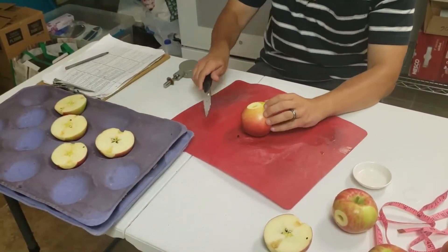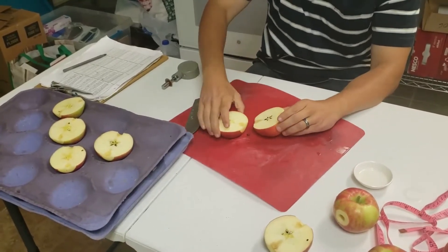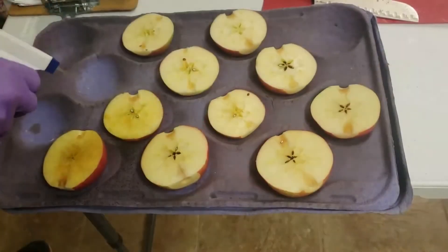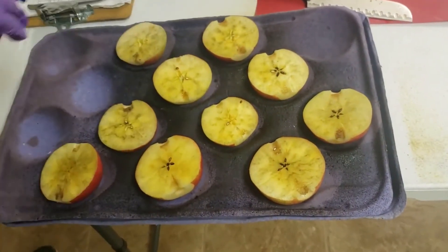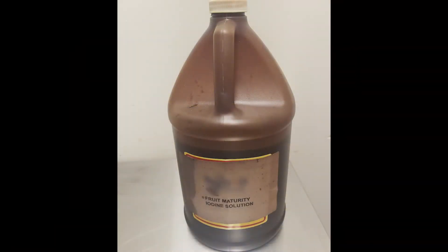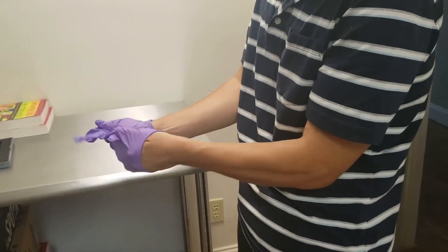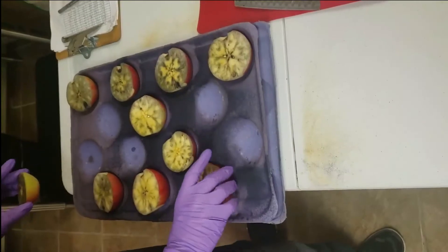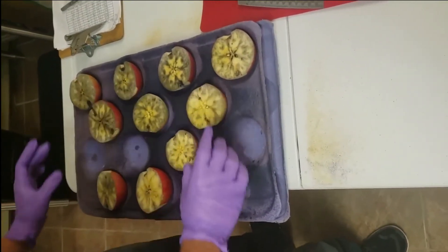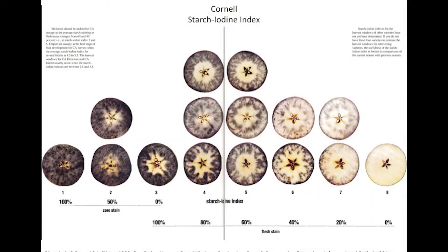There are target starch pattern indexes or SPIs for many varieties. To conduct an SPI test, cut each apple in half through its equator, halfway between the stem and calyx end. Place one half of the apple on a tray, cut surface facing up. Dip or spray apples into the iodine solution to evenly wet the cut surface and wait a minute for the iodine to react with the starch granules. Ready-made starch iodine solution can be ordered online and usually ships in gallon containers. The iodine solution is very toxic, so it is best to wear gloves when conducting this test, and treated fruit should be properly disposed of so animals cannot ingest them. Once the staining has had a chance to develop, arrange each apple in ascending or descending order according to the percentage of tissue that is stained, then compare the pattern of each stained apple half with the pictures on a starch index chart.